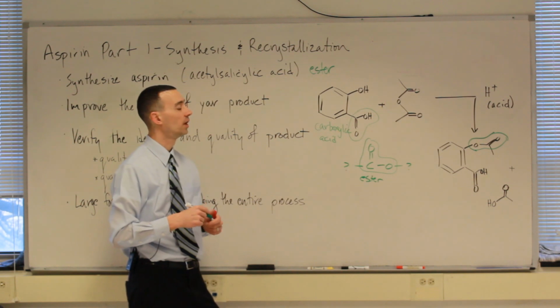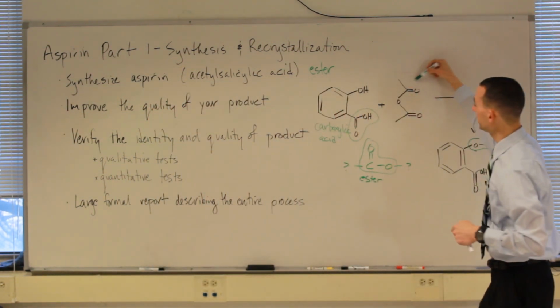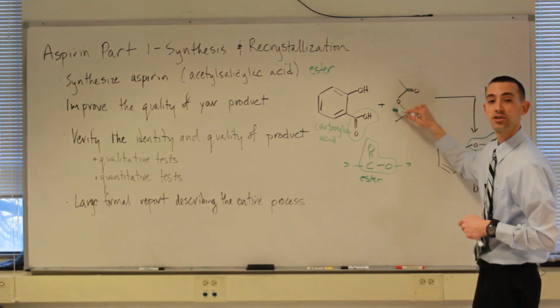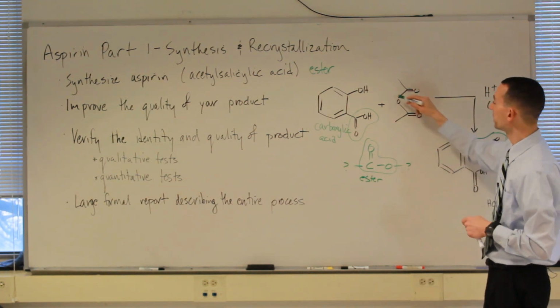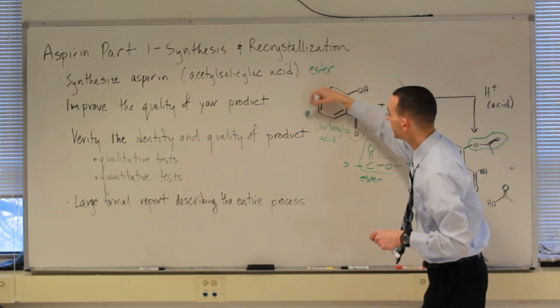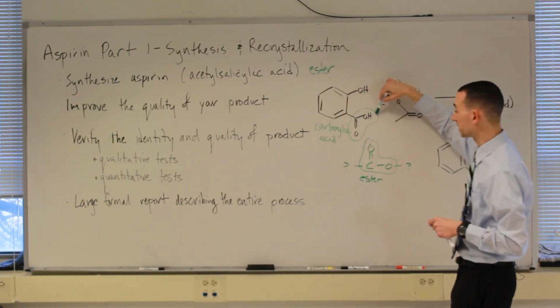And we're going to split another compound. If you look at this, it looks like potentially 2 carboxylic acids, or it's an ester in 2 different directions as well. And so this molecule will be cleaved and will attach up here at the alcohol part of our salicylic acid. That's what our starting material is called here.